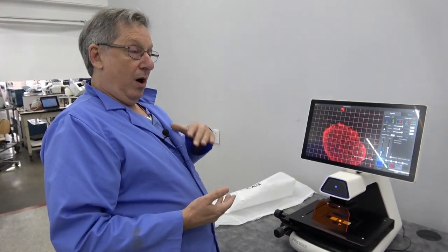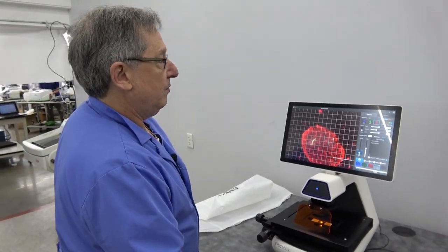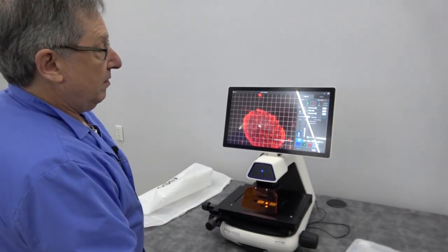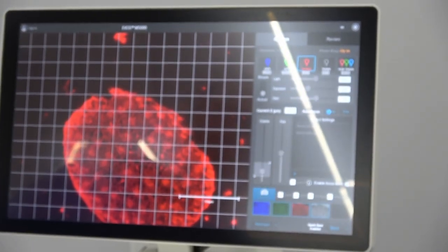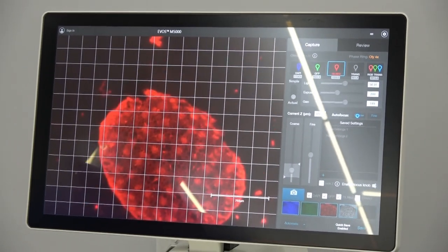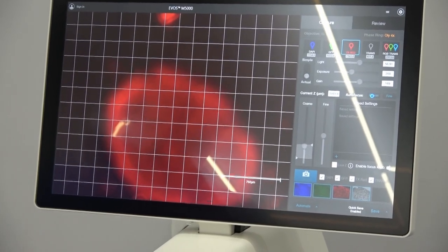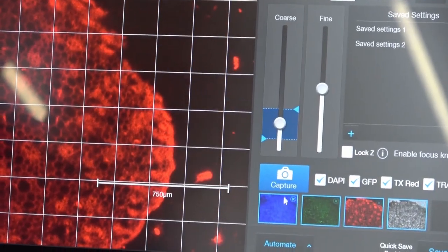It will do up to a hundred slices through your sample. Very quick, easy. Take a picture of all of them. The focus is quick. Once it's set, you can go ahead and capture that image.